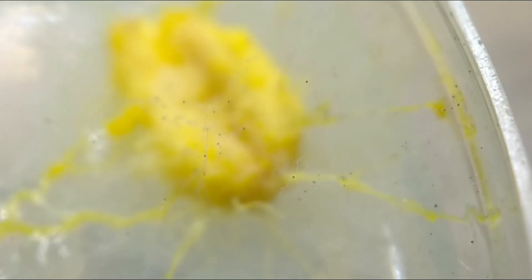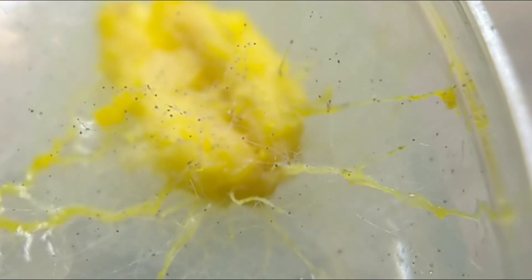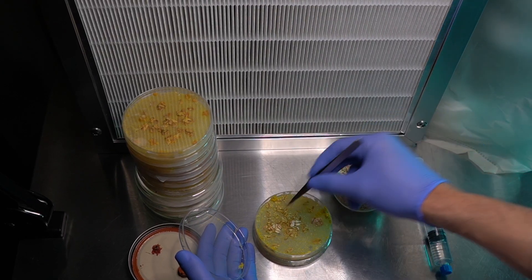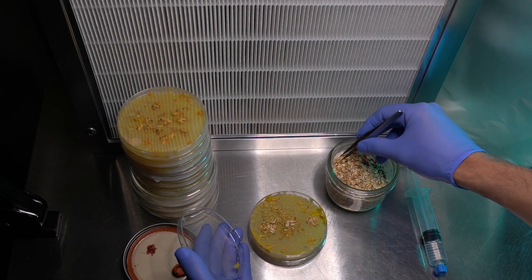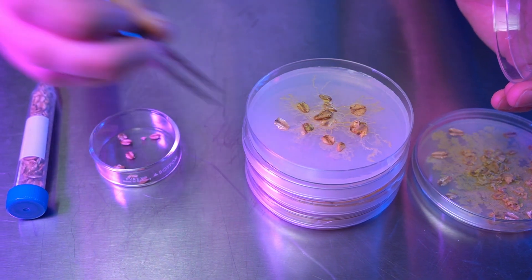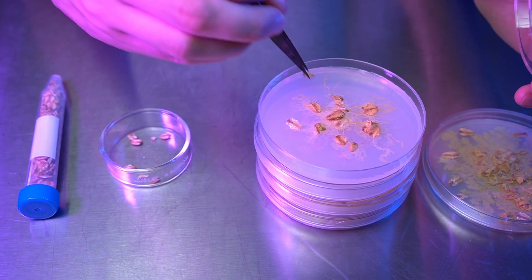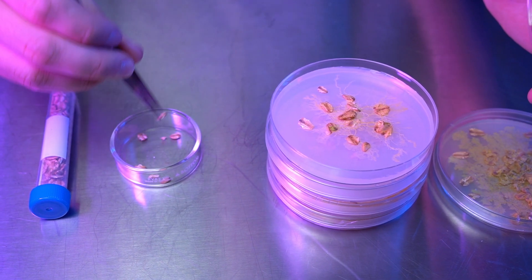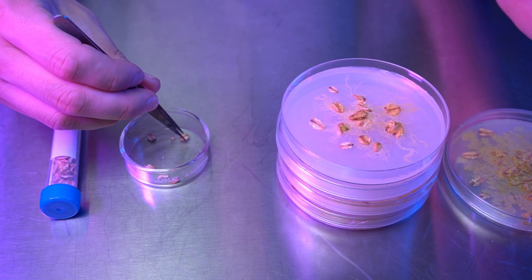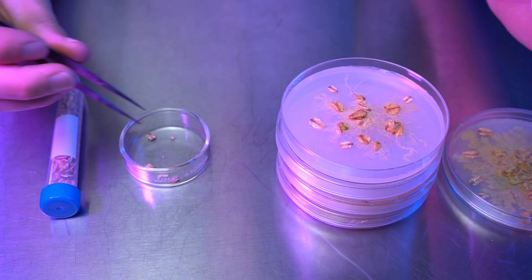As I mentioned, slime molds consume microbes, so they don't mind living alongside bacteria and mold. Therefore, aseptic or sterile technique is not necessary for their survival. However, as we will be periodically opening their containers, reducing the amount of contamination within is a good idea for your own health and hygiene. This is why it can be helpful to have a handful of cultures going, so if one becomes contaminated, you don't lose the entire culture.